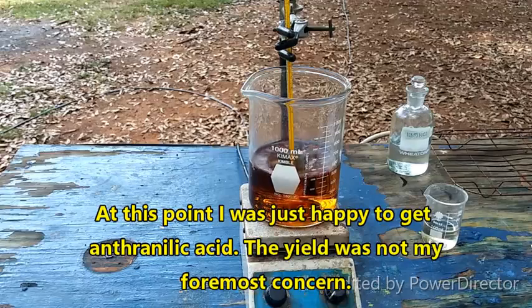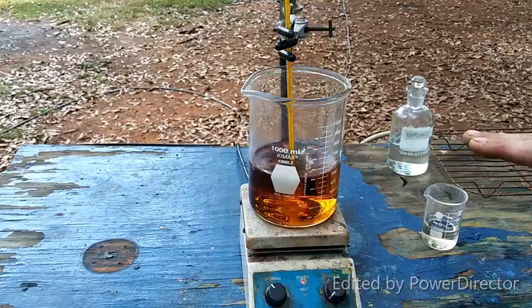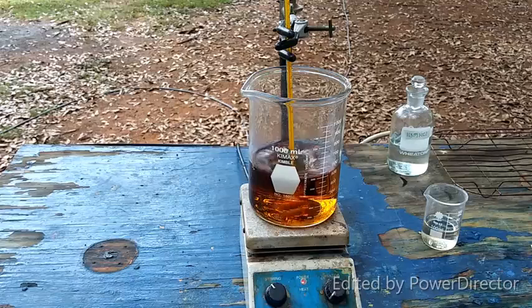And there is another step we can do to recover it, actually, because where ChemPlayer stops, this protocol continues. It has you recover the anthranilic acid that doesn't crystallize in the step that we're about to do by adding copper sulfate to this, precipitating it out as copper anthranilate, displacing copper from that by bubbling hydrogen sulfide gas through it, and then recovering the rest of the anthranilic acid that way.